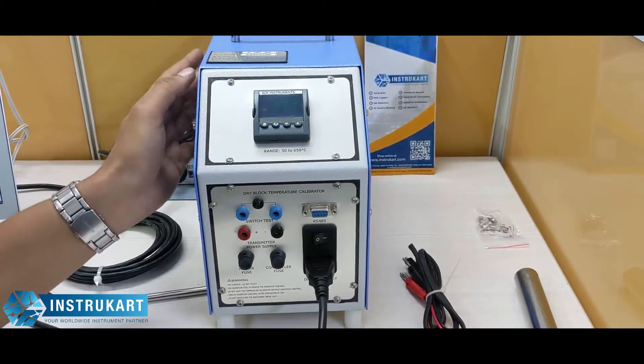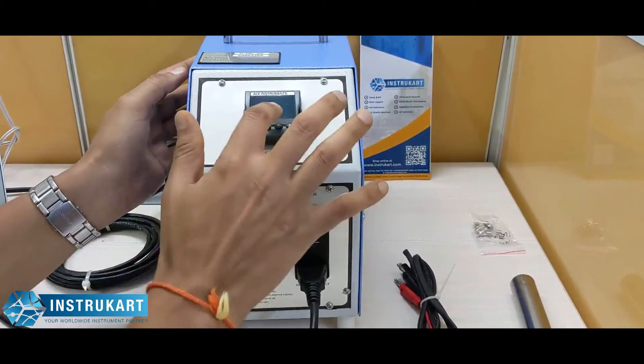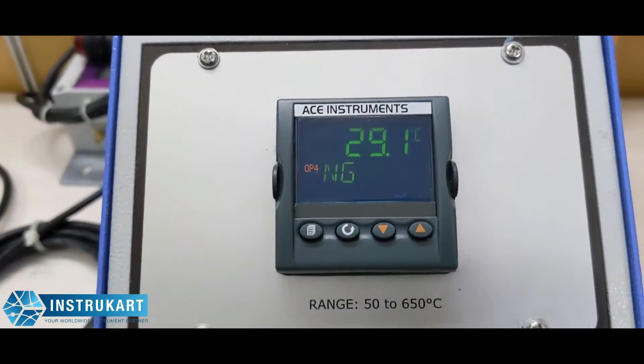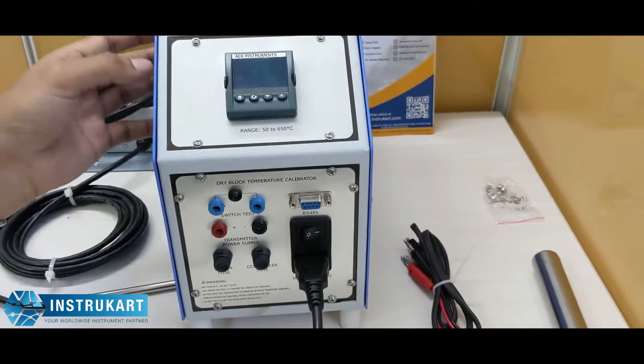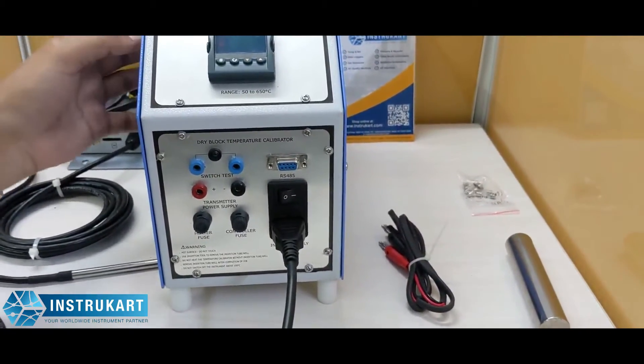The best part of this dry block calibrator is it has got a fast heating and cooling option. It has an LED display as you can see, and it is controlled through a PID controller having very good stability. It also has a facility to check the temperature switch test.